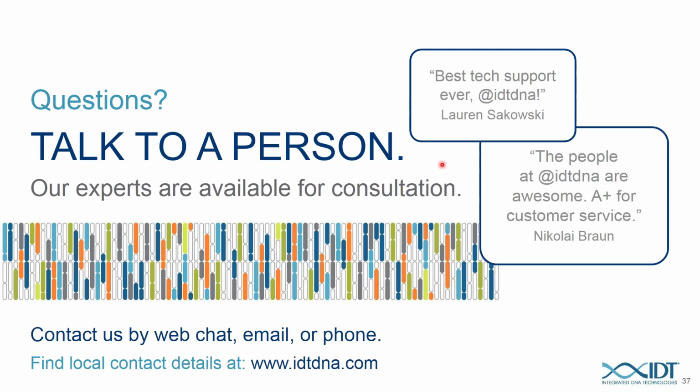This is an interesting one. Have we tried plasmid delivery of the Hi-Fi Cas9? I think you touched on that a bit. And then there's a second part, which is how does it compare to ESP Cas9?